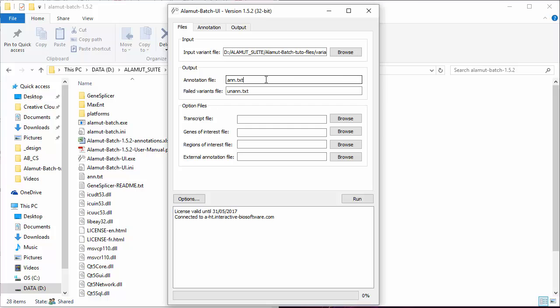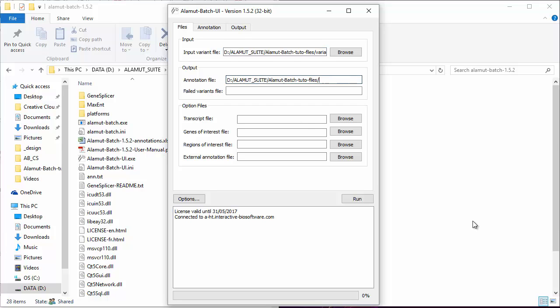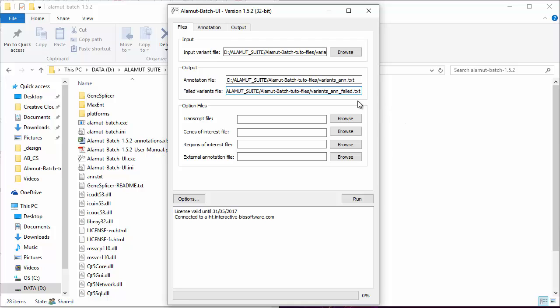Once you've selected your input file, define the output file's full path names in the output section. By default, output files are saved in the Alamut Batch installation directory. The annotation file is the annotation output file with annotated variants. If the failed variants file is set, this file lists the variants that could not be annotated by Alamut Batch.